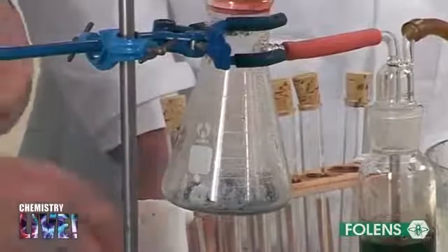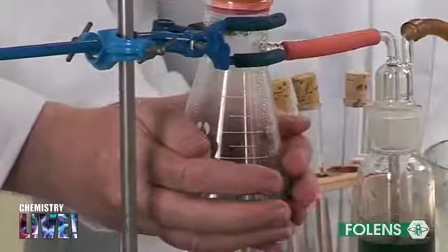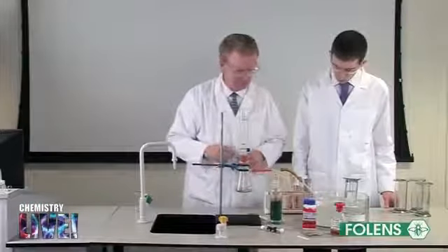Place your hand on the outside of the flask. When you perform this experiment yourself, write down what you notice. In the next part of the experiment, we will carry out a number of tests on the gas.